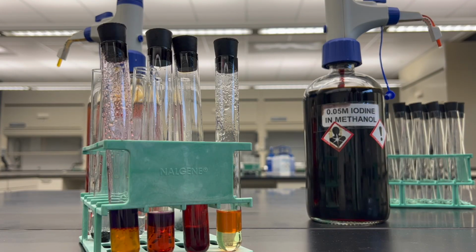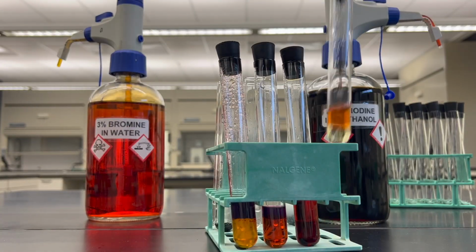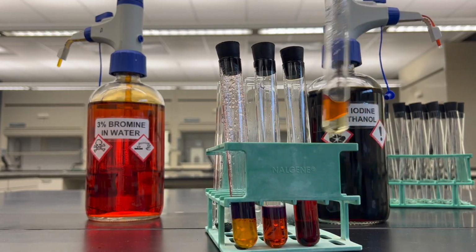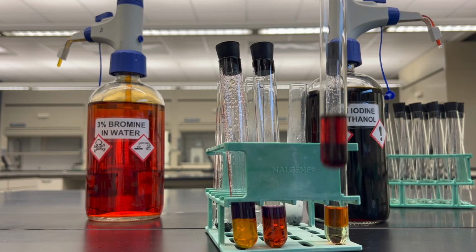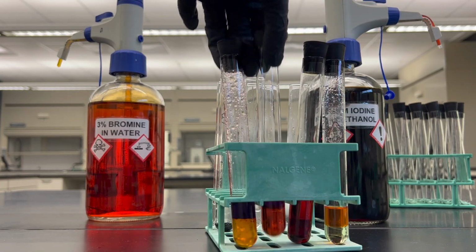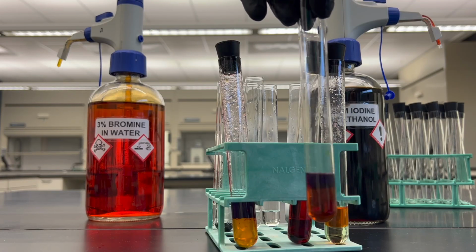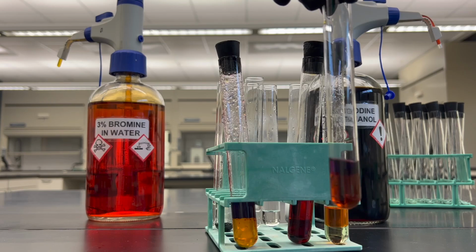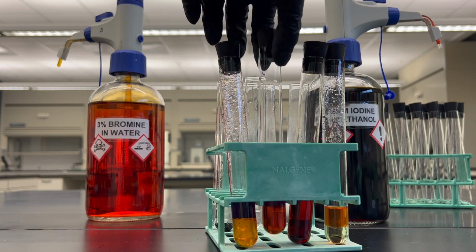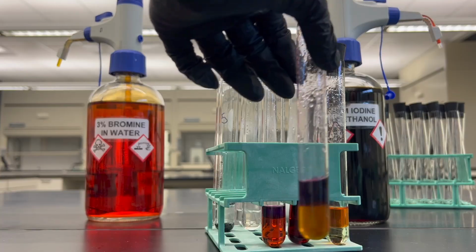So, we have a bunch of solutions here. This is bromine reacted with hexanes. This is iodine reacted with hexanes, so we see two layers. Now we can take those two layers and analyze what is where and what is now reacted with each other, both when the iodine was the ion mixed with bromine, and then when the bromine was the ion mixed with iodine.